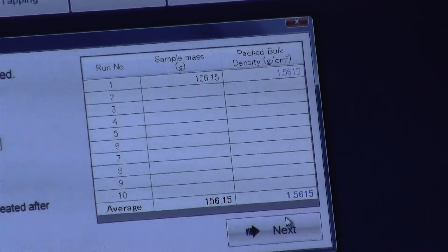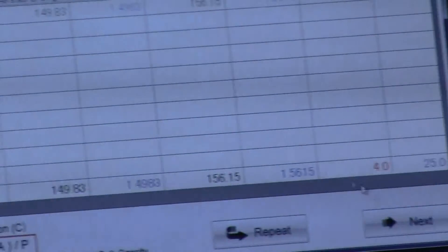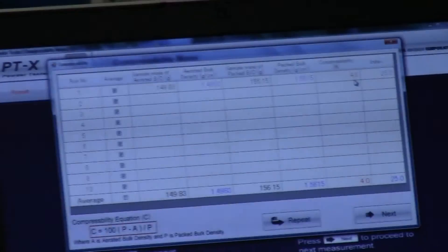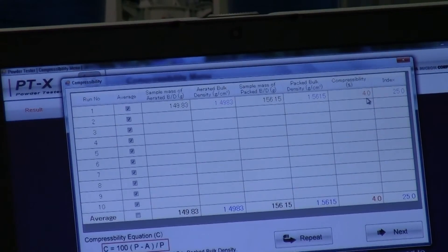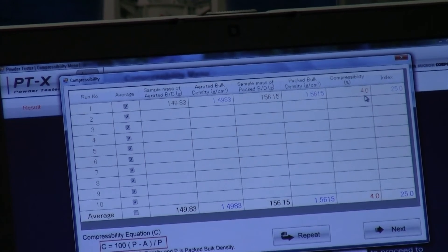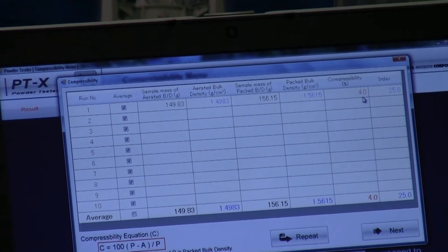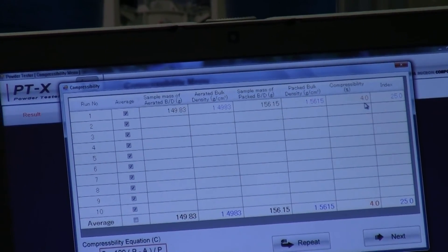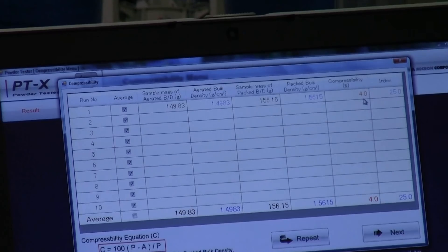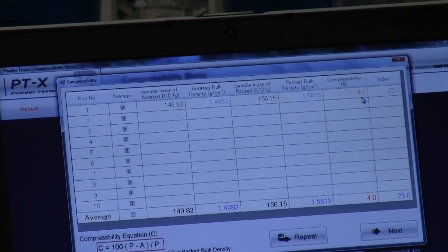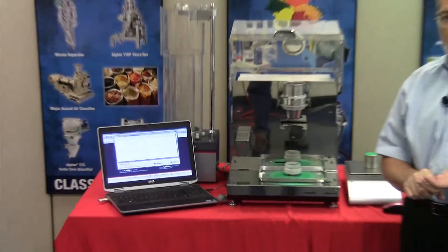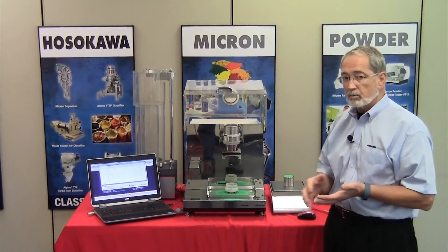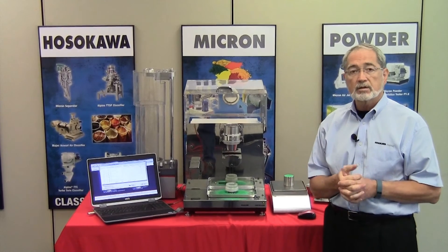Going to next, we find the compressibility is 4%. That means the differential between aerated density and packed or tap density is 4% — meaning 4% more material was compressed into that cup.